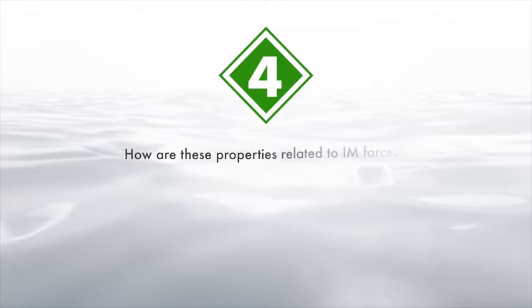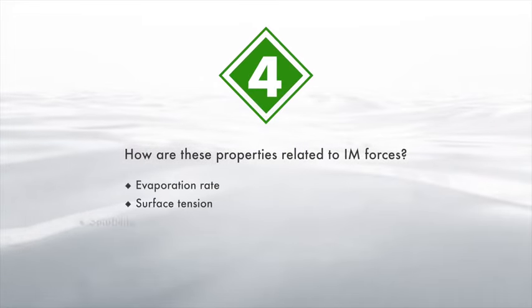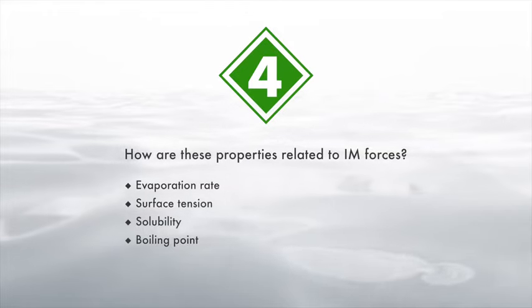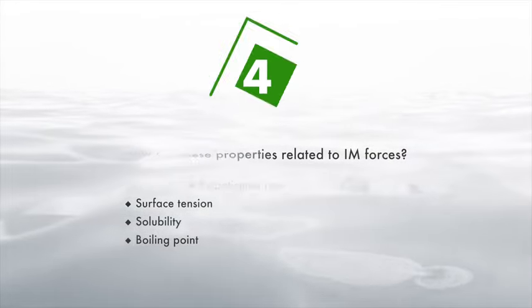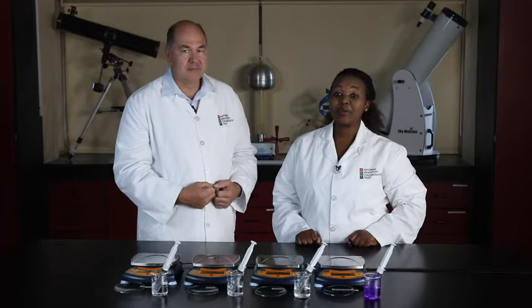Today we're carrying out 4 experiments. We're comparing physical properties of different substances to see how these properties are related to the strength and type of intermolecular forces in these substances. Let's make a start with evaporation.